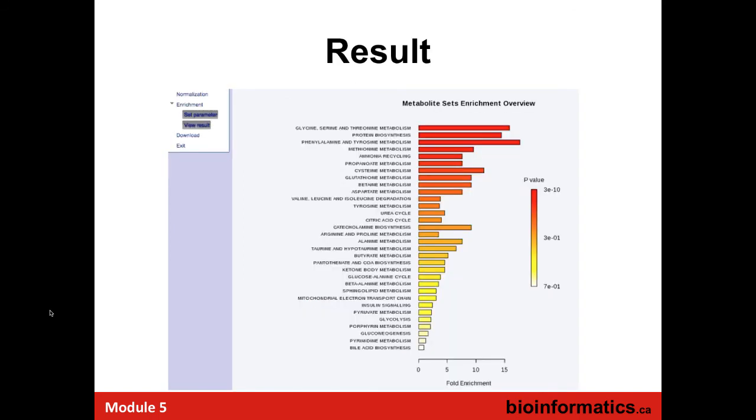And again, these are people suffering from cancer and muscle wasting. One of the first few that we see are protein metabolism and amino acid metabolism, which are all messed up in these individuals. That's highlighted in terms of the red ranking, and then things fall in terms of their relative importance.